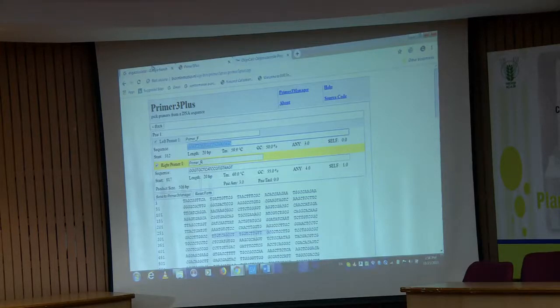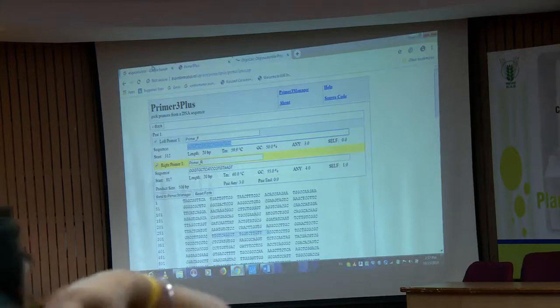Just the primer sequence you put, only the forward sequence, and then you go down and do the blast. No, not this one, it's the NCBI Primer-BLAST. Maybe you have clicked some more things over there. Okay, I'll continue this one and I'll show you there.